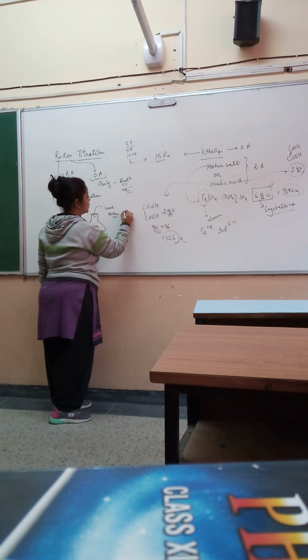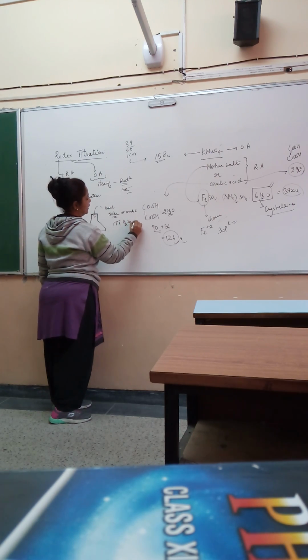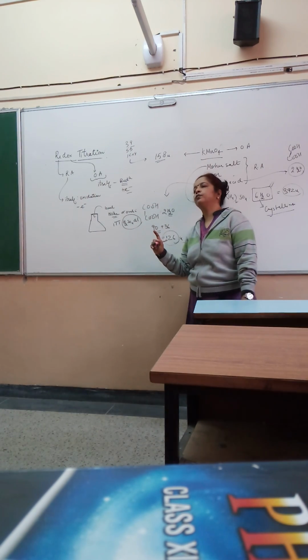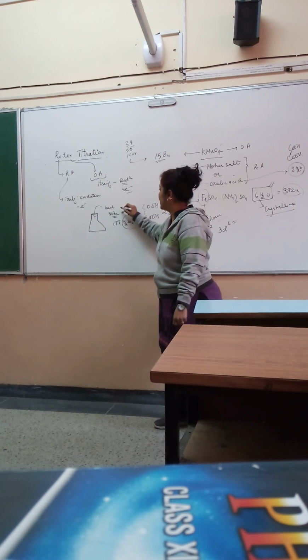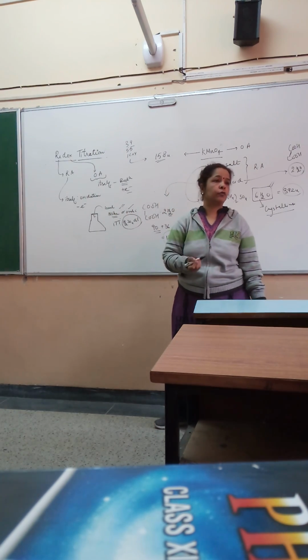Under both the situations, you require one test tube full of dilute sulfuric acid. It is a compulsion in both the titrations to use one test tube full of dilute sulfuric acid because you require an acidic medium. The acidic medium is not required for Mohr salt or for the oxalic acid. It is required for KMnO4.